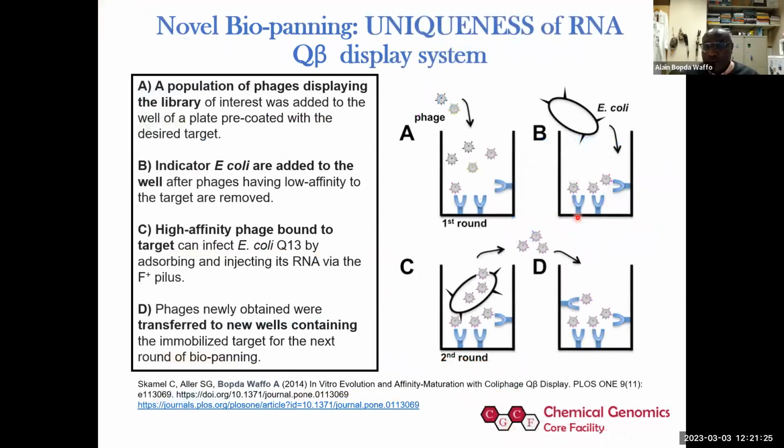So what do we do? We have the monoclonal antibody from foot and mouth disease. And those monoclonal antibodies are bound to the plate by the Fc region. So the Fab is up. And we block the plate, obviously.